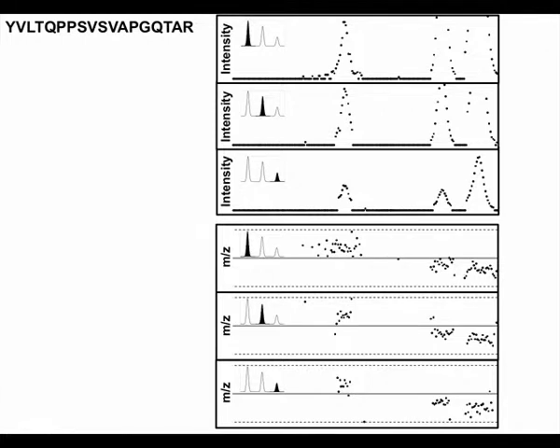So these are the kinds of things. And the other thing we see is that the mass error is slightly positive in this case for these three, and in this case for these two it's slightly negative. And actually what turns out for this whole LCMS run, the correct peaks were a few parts per million off in the positive direction, because the calibration hadn't been done better than that.